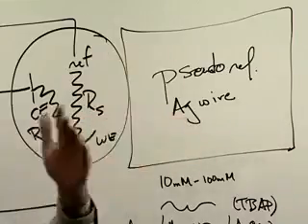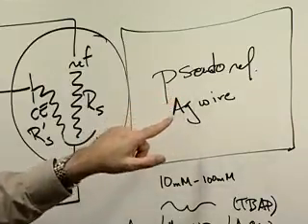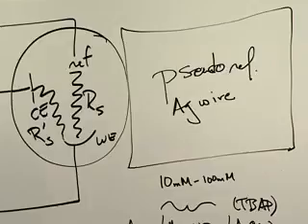A second use, again, would be if you need total compatibility of the electrolyte because it's sitting in the electrolyte. A really bad time to use a silver pseudo-reference is if you have anything around that could react with silver ions. So for example, you decide to use sodium chloride as your supporting electrolyte. You really don't want to use a silver pseudo-reference because you'll have no constant potential there, because as soon as you generate silver ions, since silver chloride is sparingly soluble, you make silver chloride, and so you can't hold that population of ions near your electrode surface.